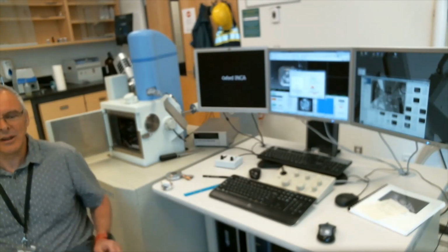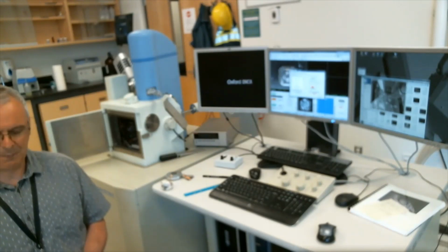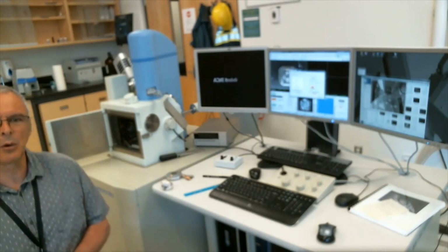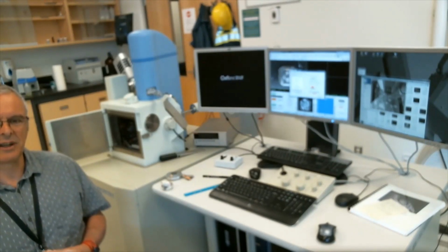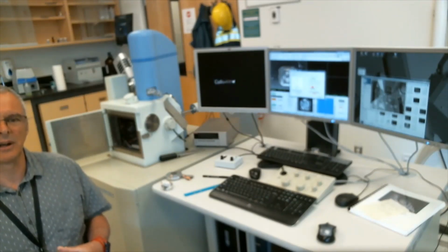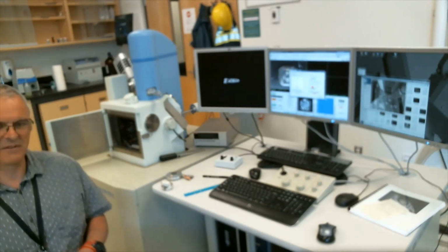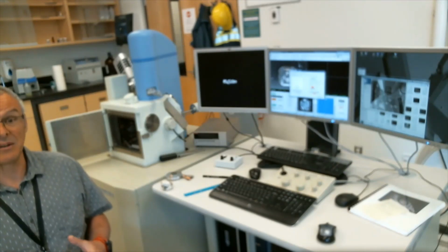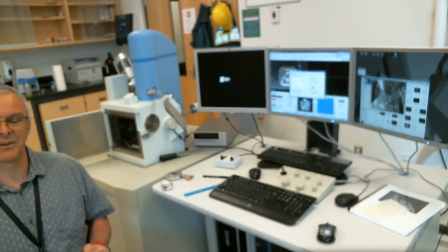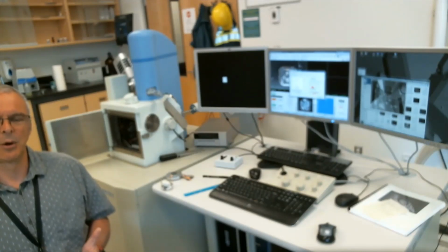We can do that in a couple of ways. We can do low voltage imaging, okay? The assumption behind this is that if the voltage is low enough, the sample can discharge by itself. It can dissipate all that electrical charge on its own. And so we just don't charge. And that's great. Really good way to look at material like butterfly wings or biological material that we don't want to coat. And it's a nice gentle way to look at these things.